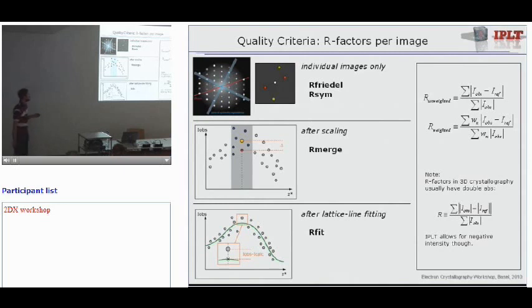Normally, if you have a symmetry, even if you have a tilted image, you will have some zones where the points of symmetry relate, and they also have the same C star, so you can actually compare them. For a non-tilted image, it should be all the peaks, but for a tilted image, you have just very small zones where you also have the same C star.